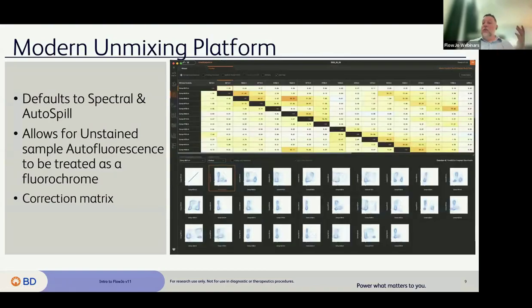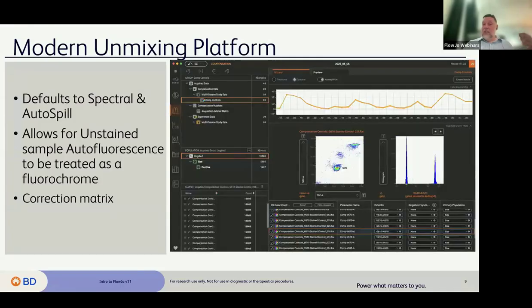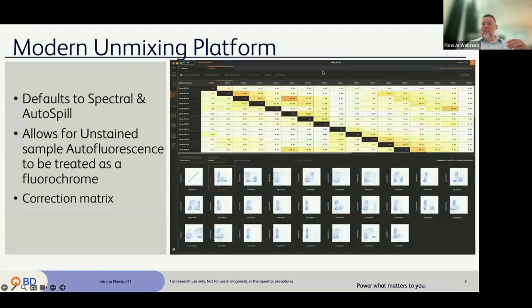All right, if you set up your positive and negatives and you run the calculation, you can actually choose to create the matrix immediately, or you can preview the matrix before it's actually created to see if it's what you like and go back and forth. So when you create a matrix or preview a matrix, you get the actual matrix that's going to be calculated, displayed. And there are radio buttons up here to show different aspects. This is in preview form, so we're just showing the preview of the matrix.